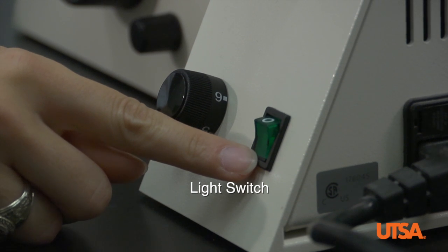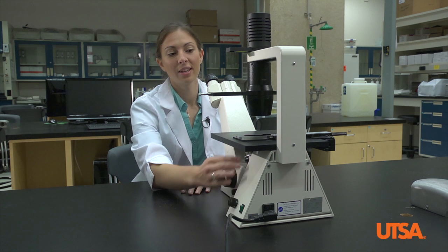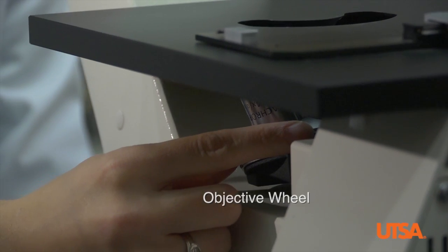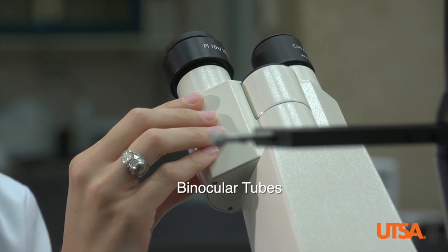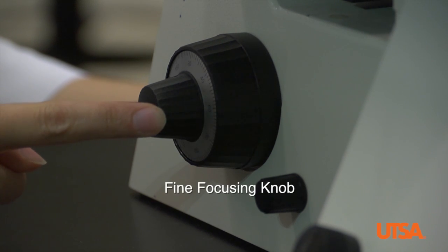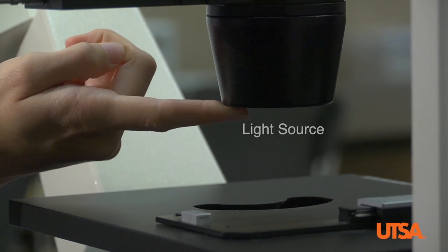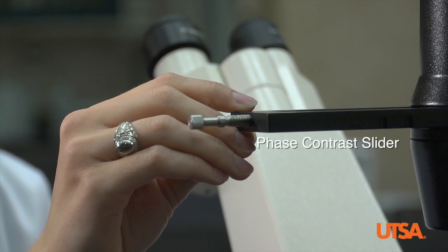The basic parts include the light switch, light dial, the objective wheel, binocular tubes, coarse focusing knob, fine focusing knob, microscope stage, light source, and the phase contrast slider.